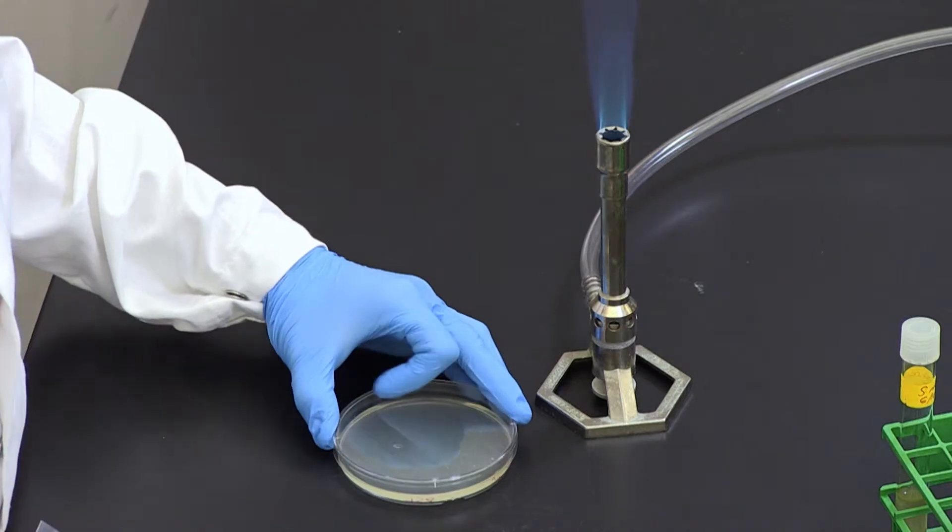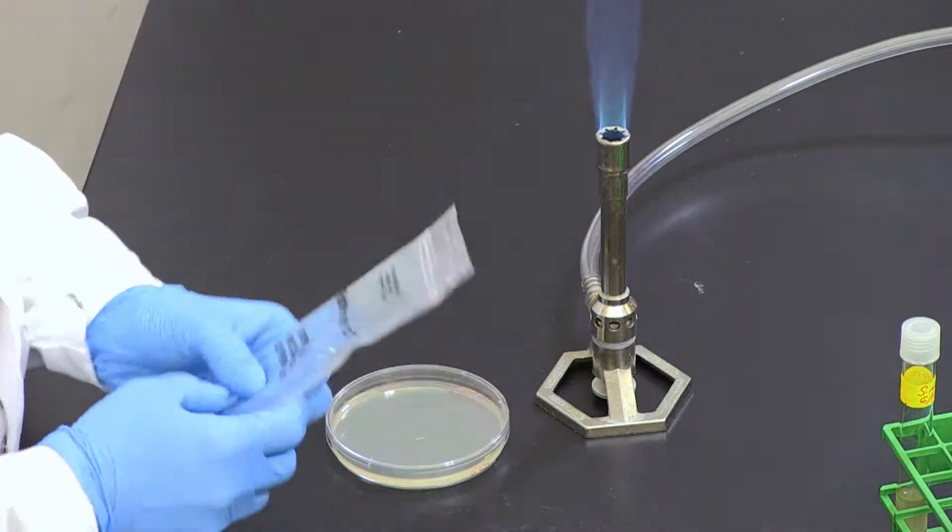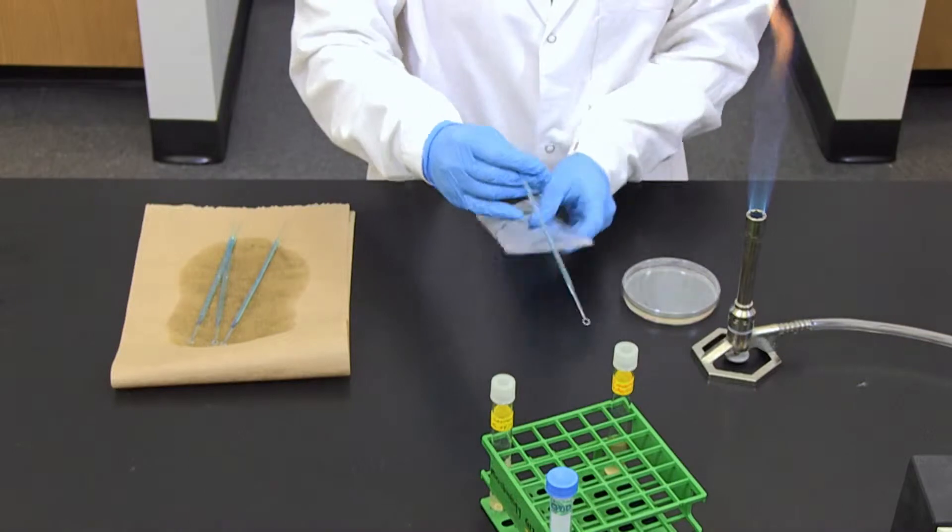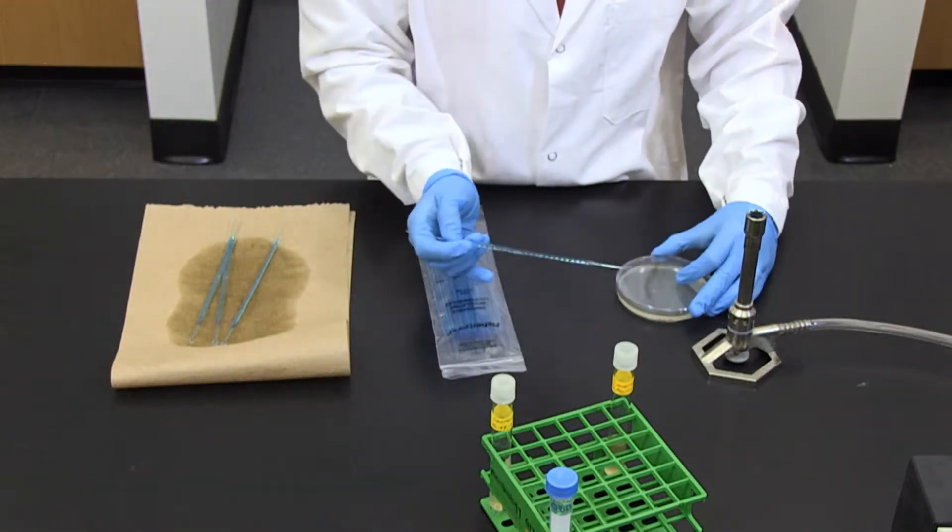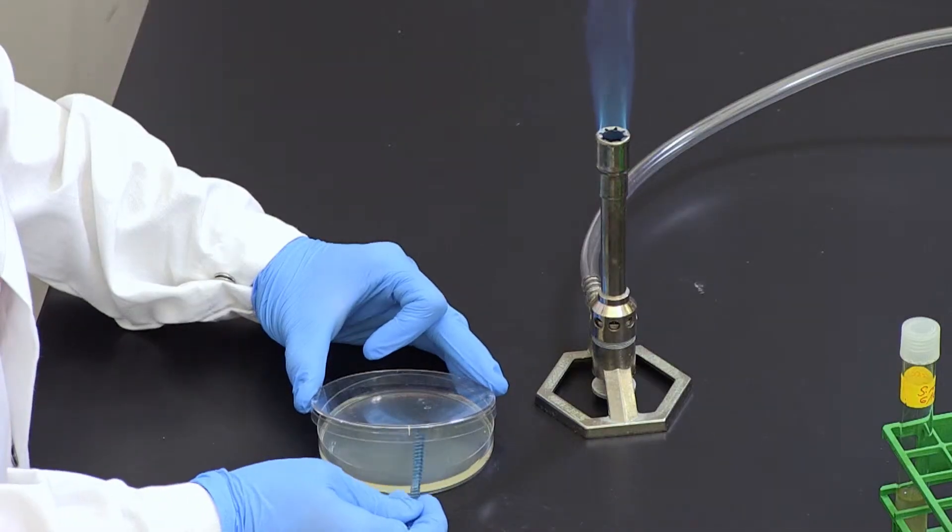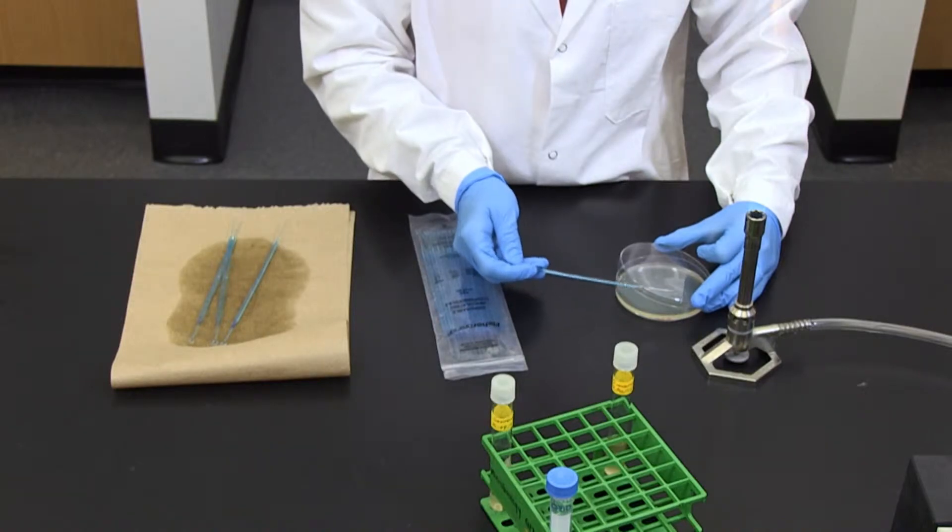Next, rotate the plate 90 degrees while keeping the plate closed, and streak area 3 several times back and forth with a sterile inoculating loop, hitting the second streak a few times.